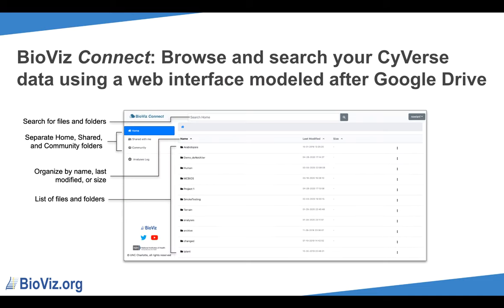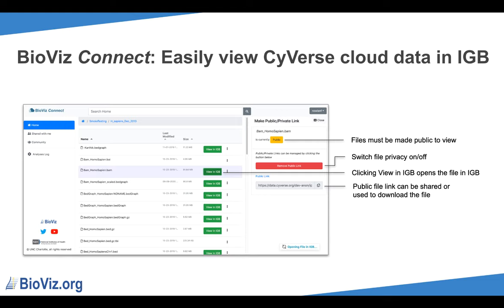BioViz Connect does not see or have access to your password, and you will never need BioViz Connect credentials — everything is handled with your CyVerse account. On logging in to BioViz Connect, you will see your CyVerse files and folders. BioViz Connect uses a modern web interface modeled after common cloud storage sites. Navigate folders by double-clicking on them. You can organize each page by name, last modified, or size, and search for specific files or folders using the search bar at the top. The aim of BioViz Connect is to make a seamless experience for viewing your CyVerse data in IGB. Files that can be viewed in IGB will have a View in IGB button next to them. With IGB open, clicking View in IGB in BioViz Connect will load that file into IGB.